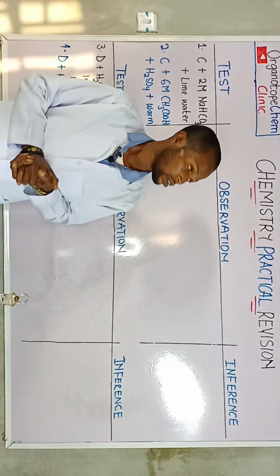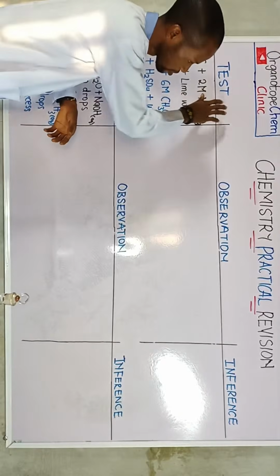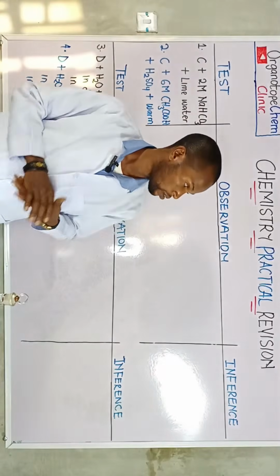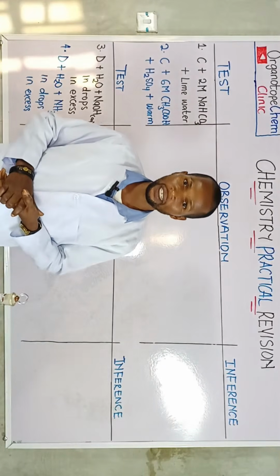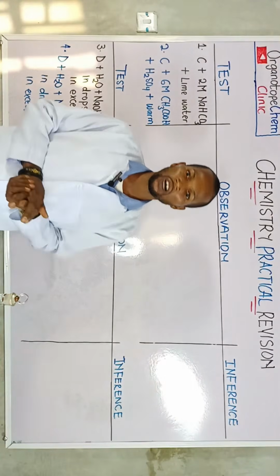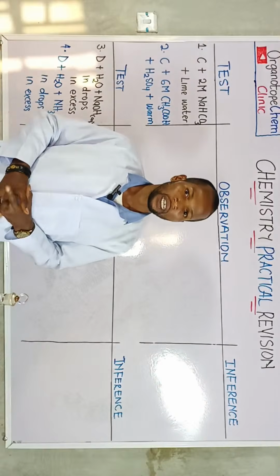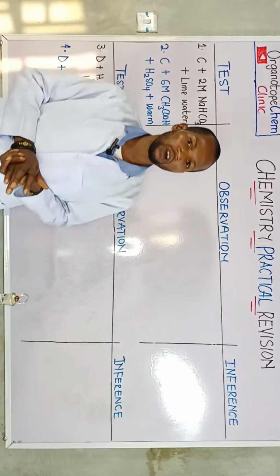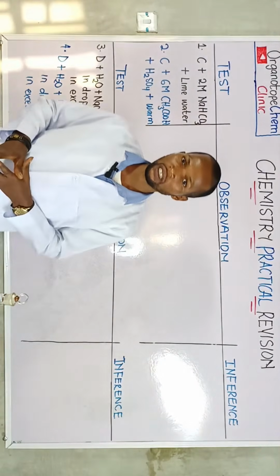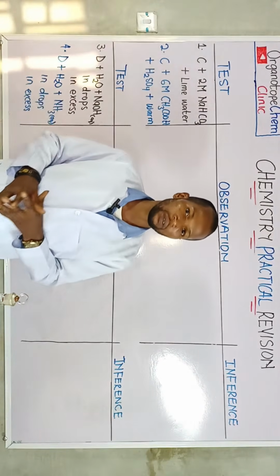The normal laboratory format for recording in qualitative analysis involves the tests, observation, and inference. That is the normal laboratory format for your recording on qualitative analysis. Now, in this qualitative analysis, we are going to be focusing on the organic analysis as well as the inorganic analysis. In the organic analysis, we're given a mixture of organic compounds, which was labeled sample C.